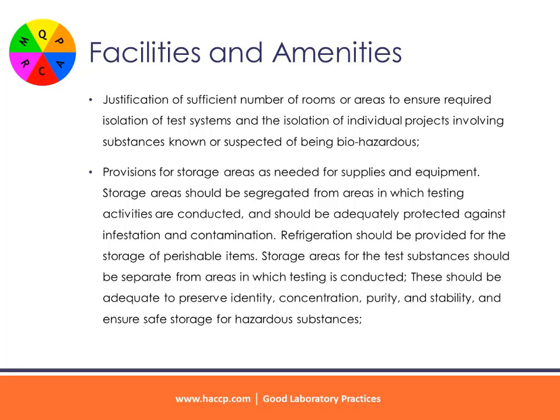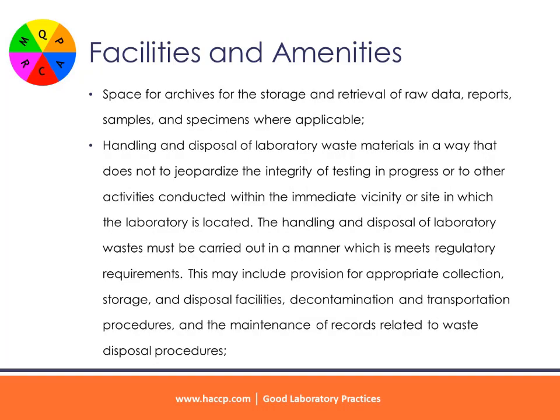Storage areas for the test substances should be separate from areas in which testing is conducted. These should be adequate to preserve identity, concentration, purity, and stability, and ensure safe storage for hazardous substances. Space for archives for the storage and retrieval of raw data, reports, samples, and specimens where applicable.